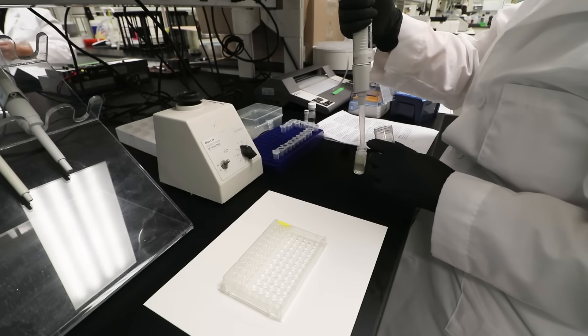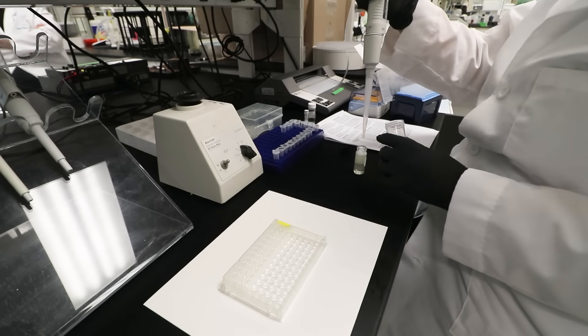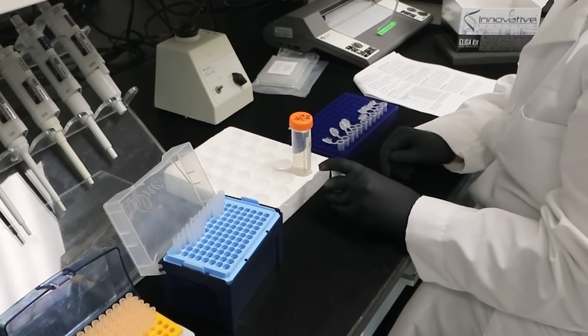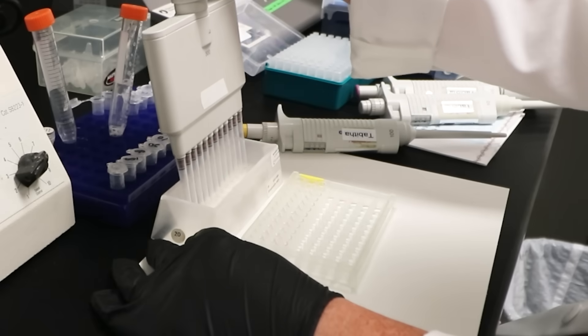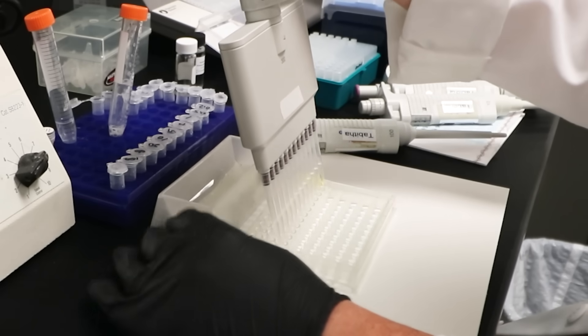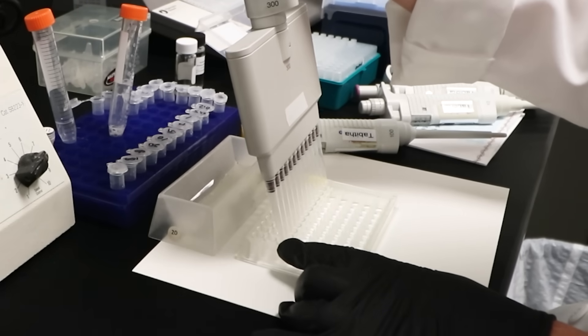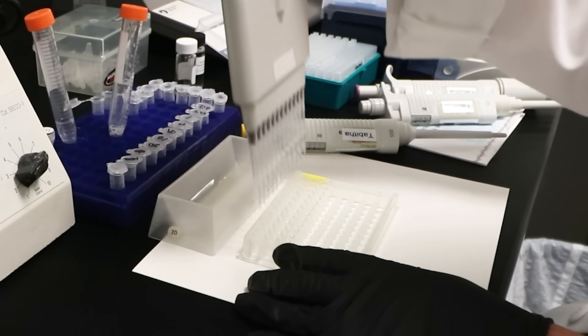After washing the plate, reconstitute the primary antibody by adding 10 milliliters of blocking buffer directly to the vial and agitate gently to completely dissolve the contents. Add 100 microliters of this dilution to all wells. Then shake the plate at 300 rpm for 30 minutes and wash the wells as you did in the previous step.